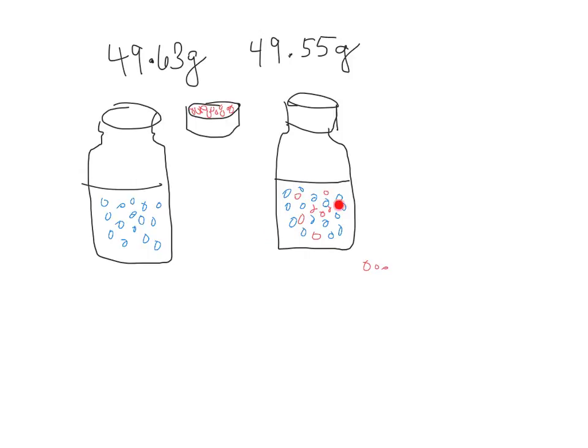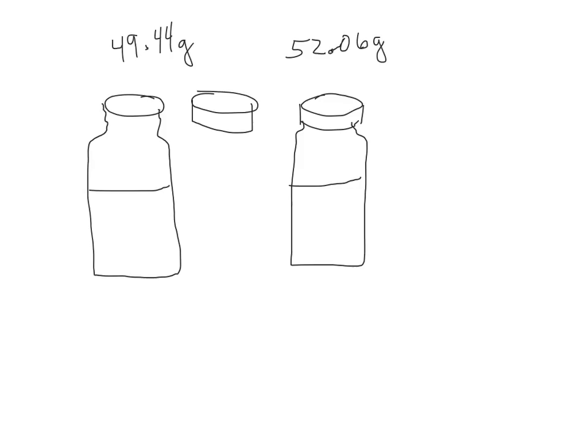I have fewer particles here than I have here. The after has less than the before. I'm demonstrating that by showing you that I have some particles that have not made their way into the vial. Next. Okay.